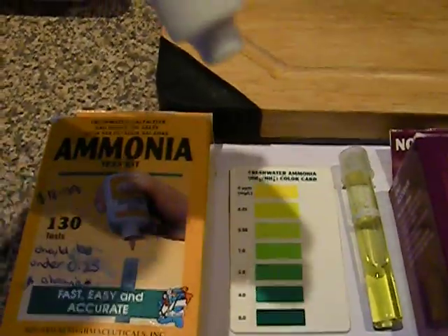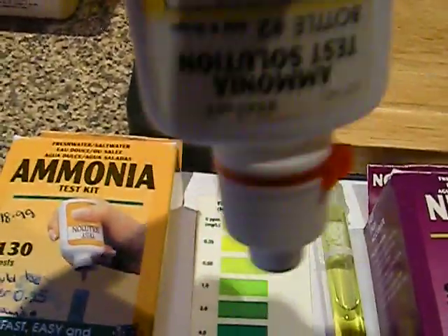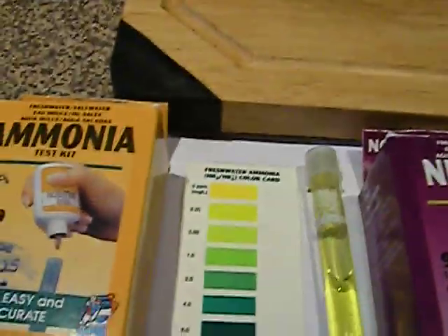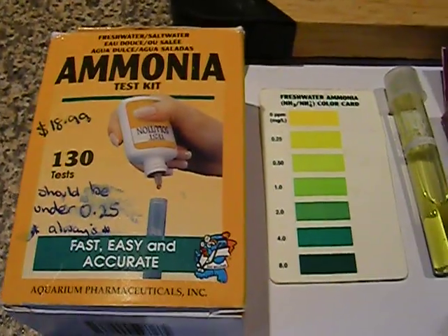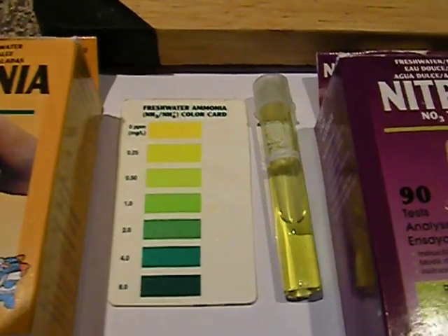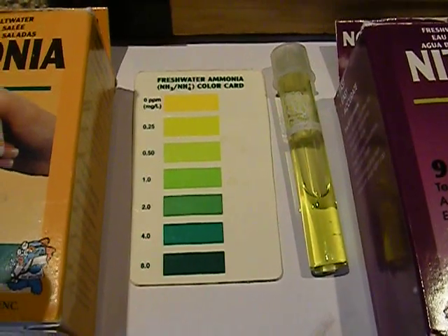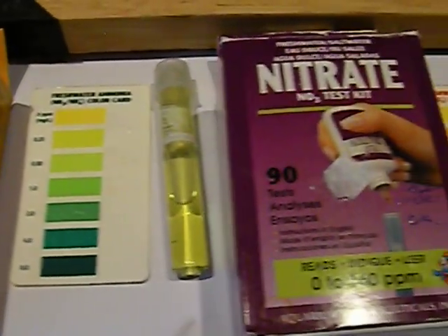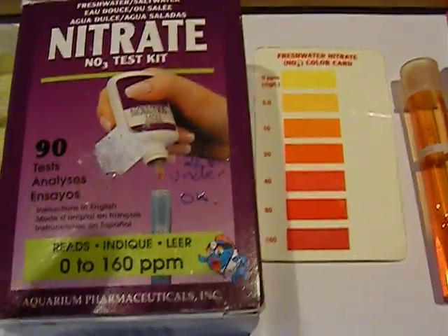These basically you fill the tube with water and drop the amount suggested into the tube to give you the change of color. A bit more fiddly, but I think the test result is well and truly worth that bit of extra mucking about. This is your ammonia test kit.